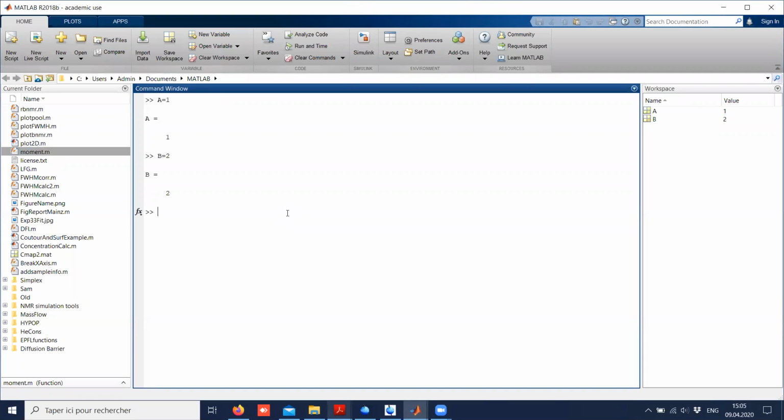Quentin, I have a question. Yes. It's going to be the case at some point that, for example, this tab on the left where you have current folder, people will close the tab and not be able to reopen it, which happens on things like Topspin as well. So how can we access that tab if it's closed? Yes, that's a good question. I can write the question in the chat if it can't be answered, and then we can discuss them afterwards.